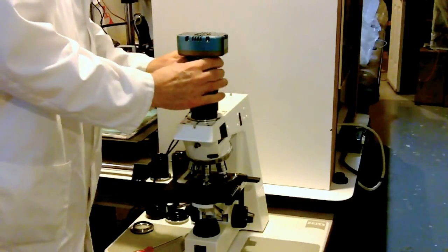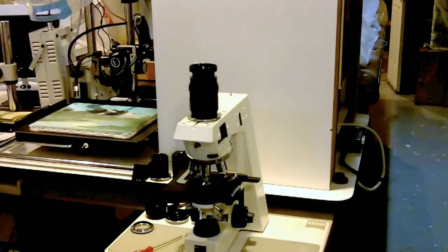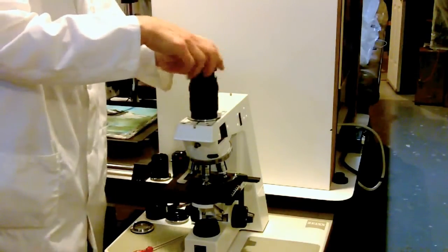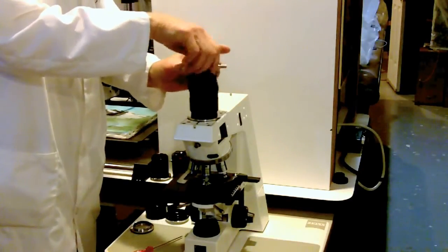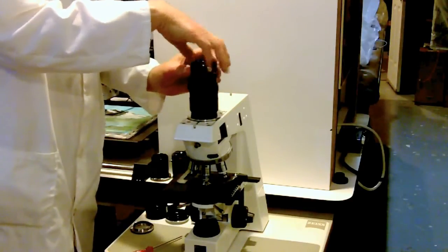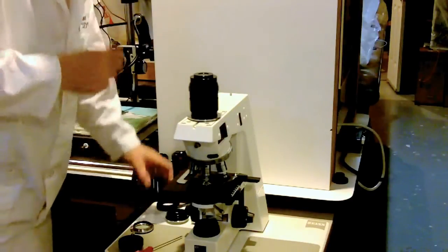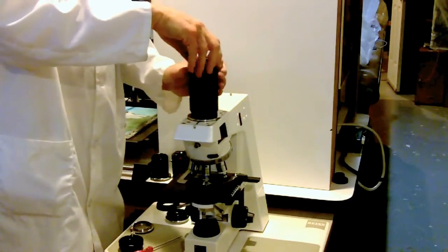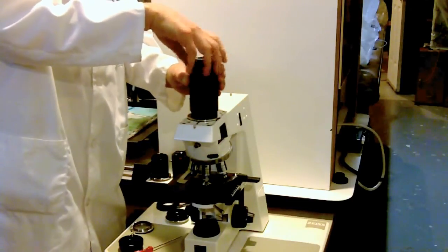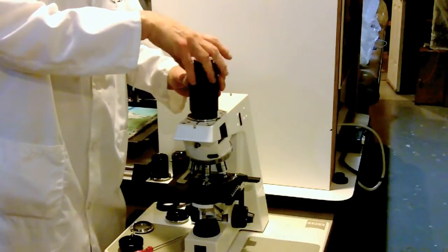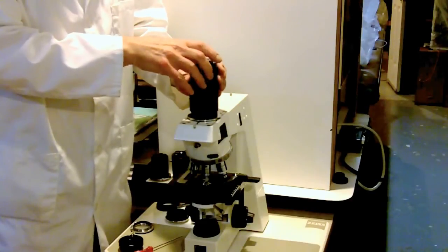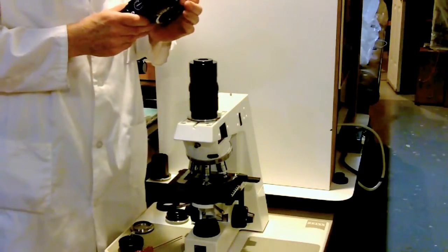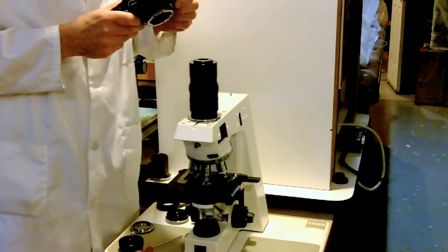So here it is mounted with a C-mount and of course these days many people will want to attach to the microscope their DSLR camera. So if we take off this C-mount adapter ring off of the InFocus we can very quickly then put on a component which is a 2x adapter. It's a 2x optical component that goes on and now with this we can use up to full frame 35mm format cameras.